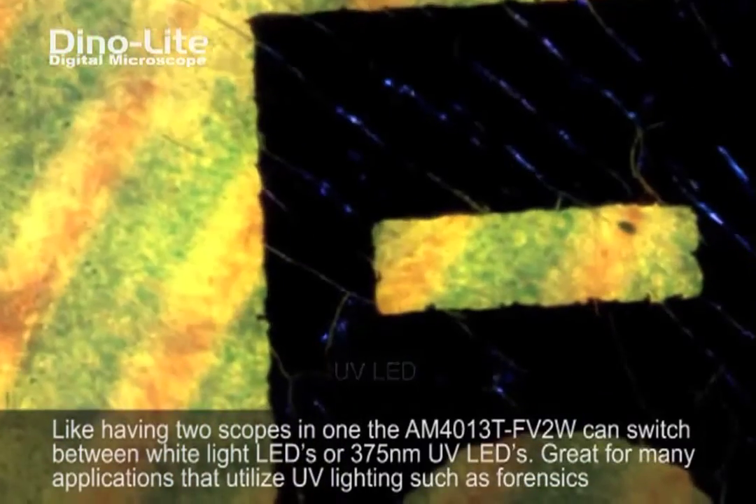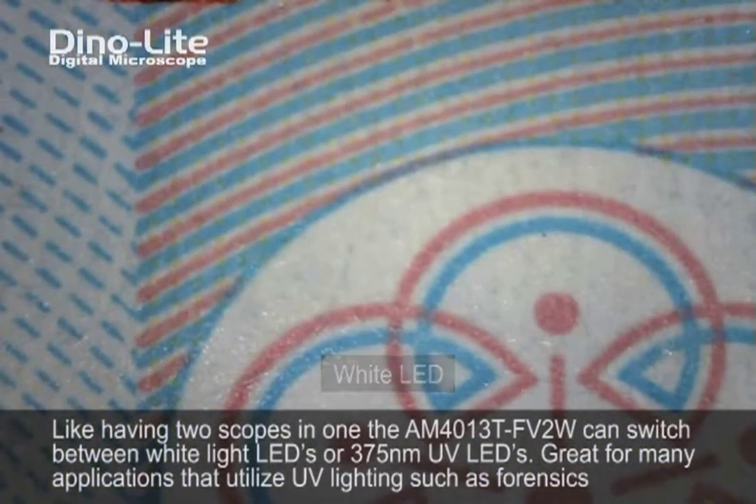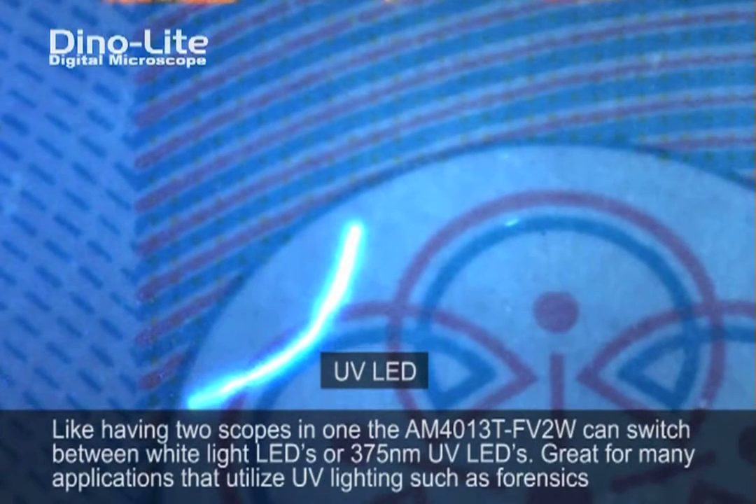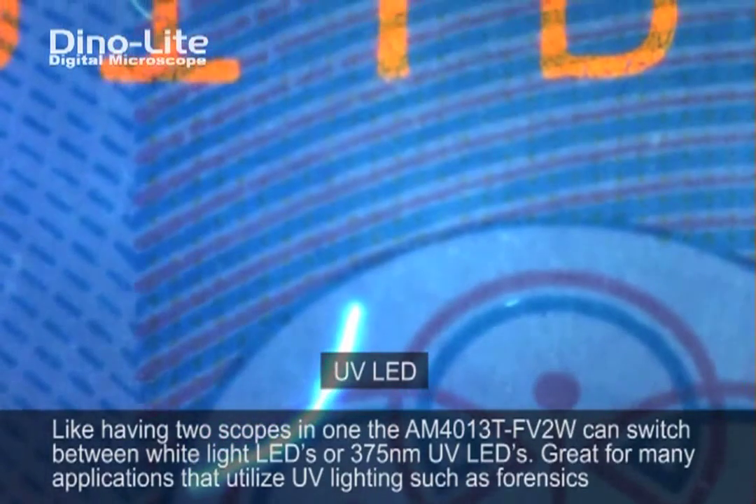As you can see within our demonstration, we are using a number of different objects and looking to see if anything fluoresces on them or if they have any identifying markings. We do!